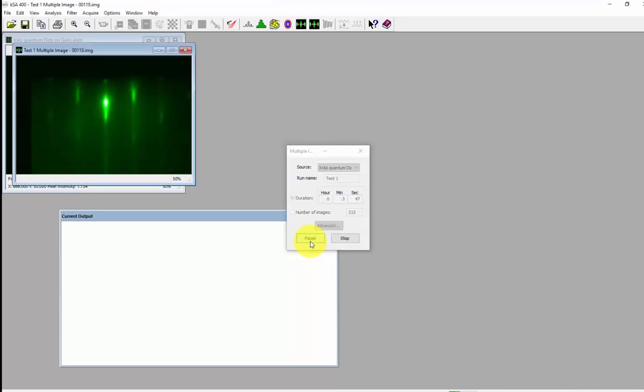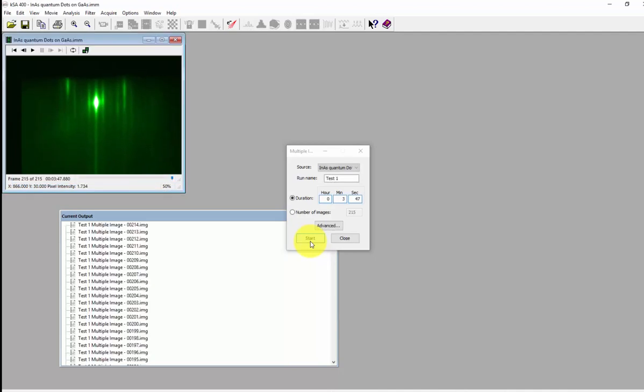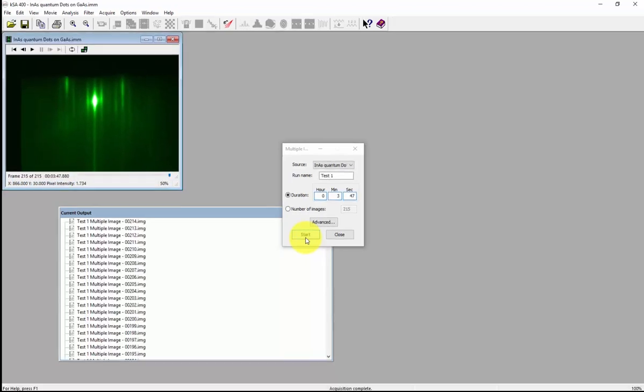The images will save as .img files in the current output folder that you have set up in your software. You can then export these as a different file type if you want for processing.